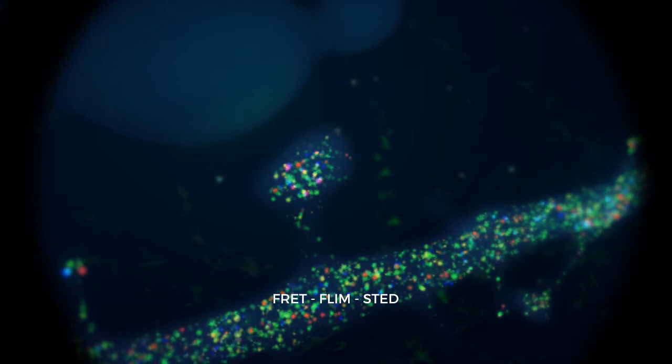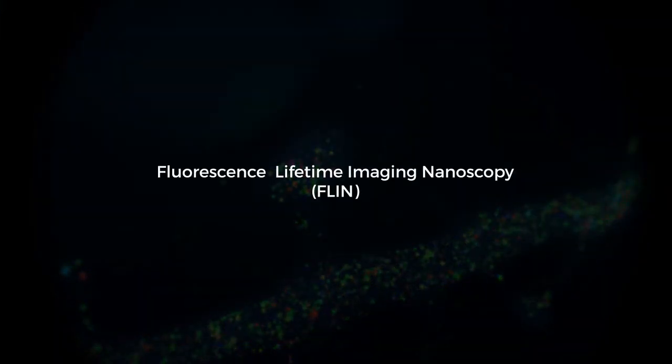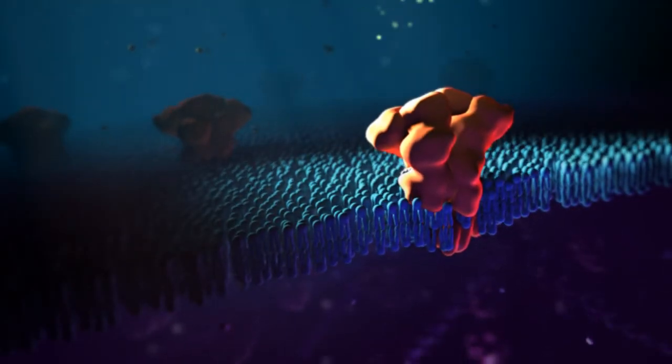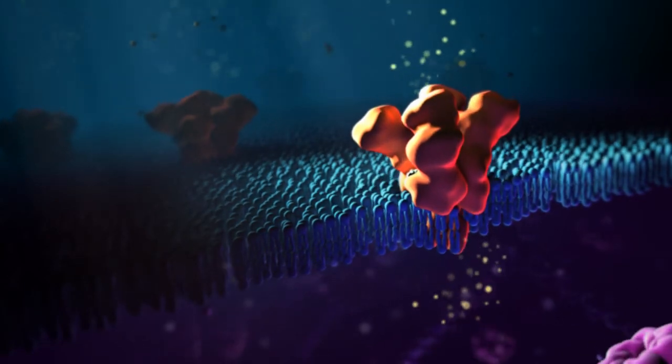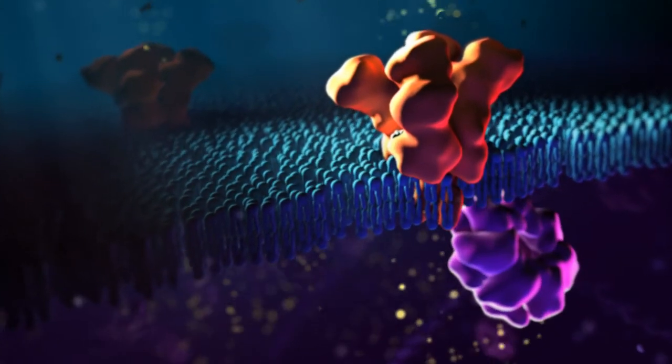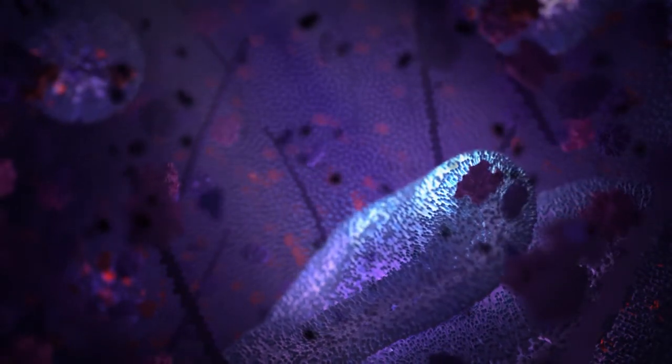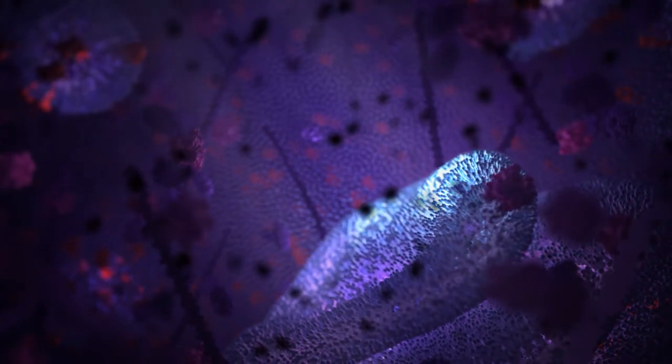By combining the FLIM-FRET technique with STED nanoscopy, Fluorescence Lifetime Imaging Nanoscopy allows for the precise localization and quantification of important protein interactions involved in neurotransmission, enabling a deeper understanding of the mechanisms behind learning and memory formation. This imaging technique provides a novel way to explore the detailed molecular processes that occur within living cells, and it has the potential to impact many disciplines of biomedical sciences.